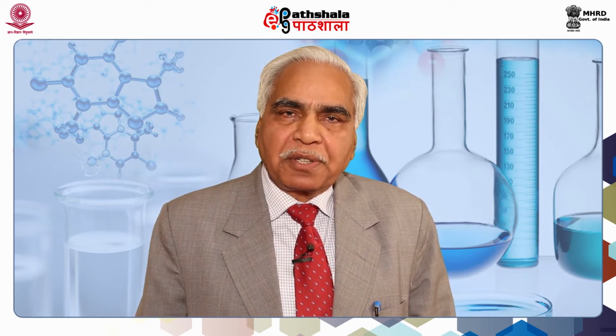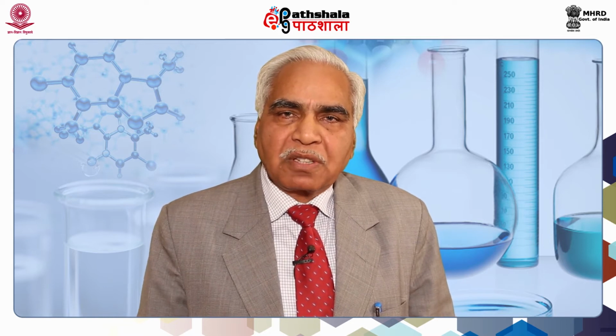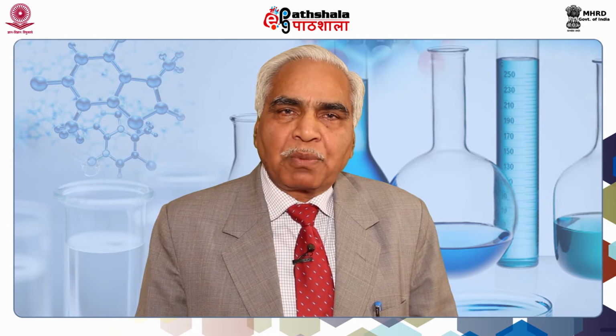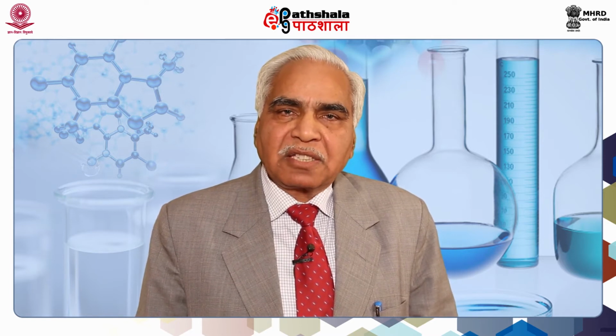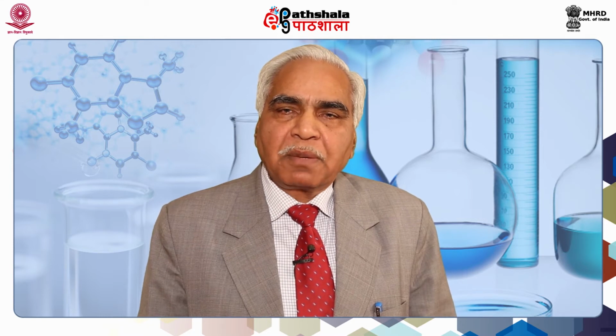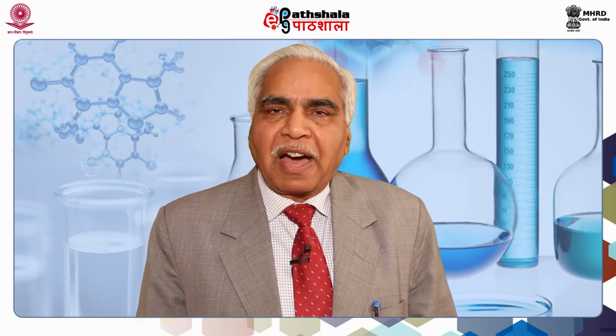If we see the chromatographic techniques, there the main purpose is to separate the molecules. So for separation purposes, chromatographic techniques are best suited. But at the same time, these can also be used for the quantification of the molecules. I will be covering in this presentation theoretical as well as practical aspects of isoelectric focusing.